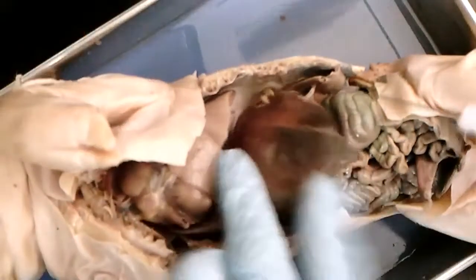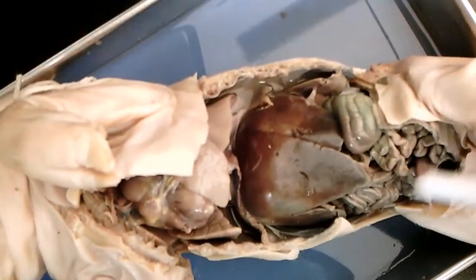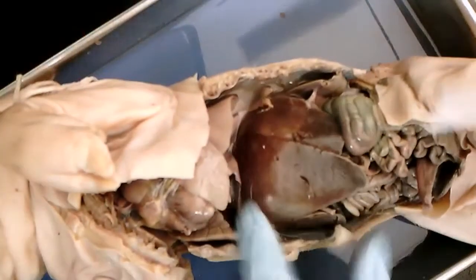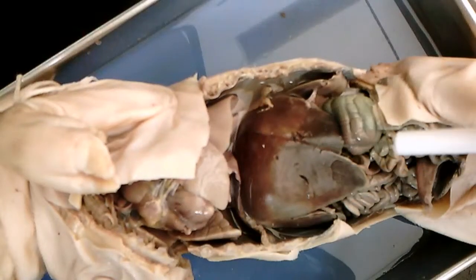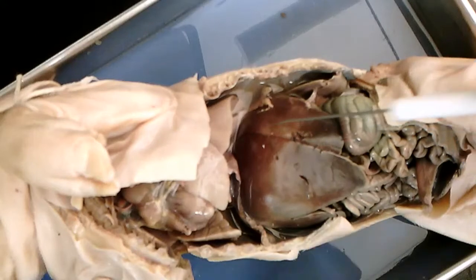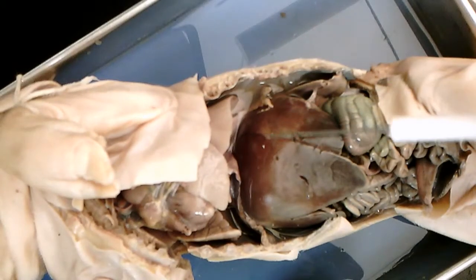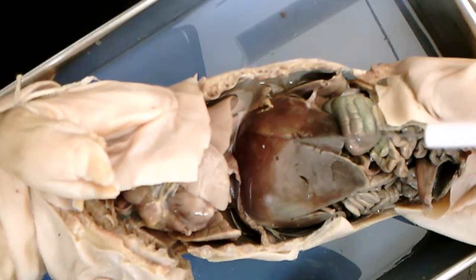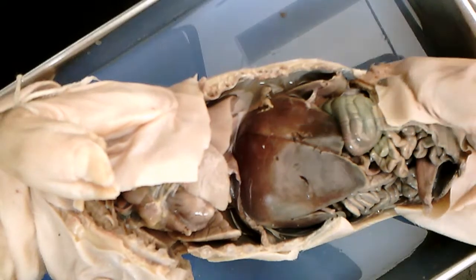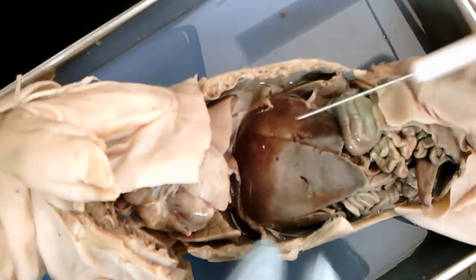Then on the packet that I'm going to put online, it talks about the liver. I'll give you an example of what it might say. It says the liver will be the most obvious organ at the anterior end of the cavity. So they need to know what anterior means. They need to know that means towards the head. It is a large, firm, and typically dark brown in color, although it's sometimes green. Then it gives its function as well in the packet.